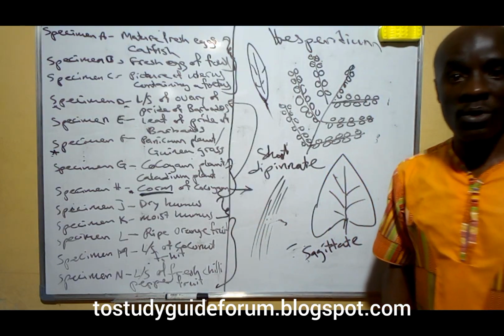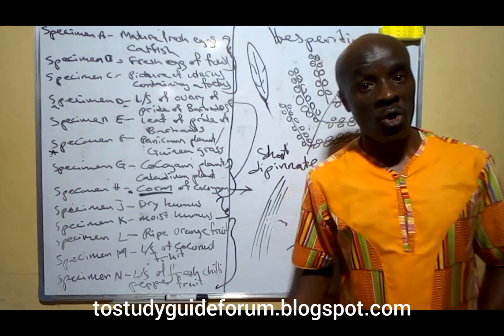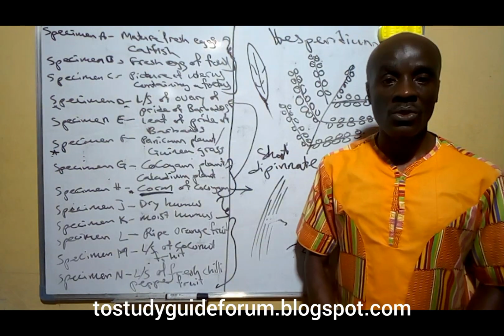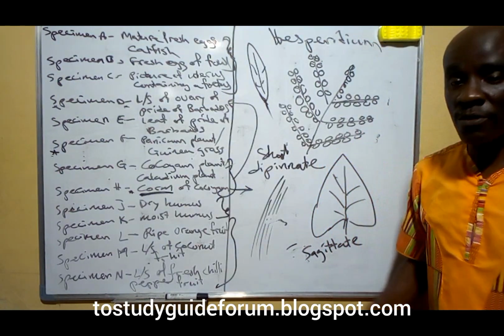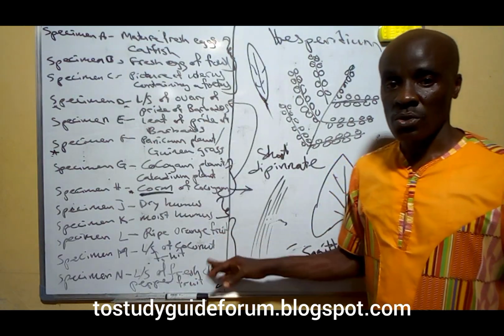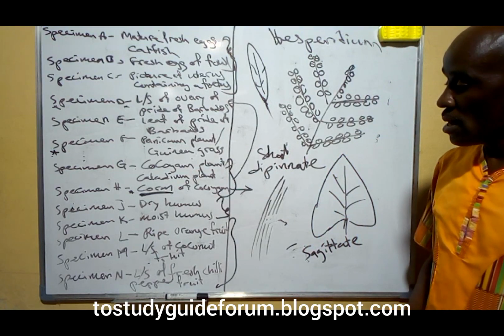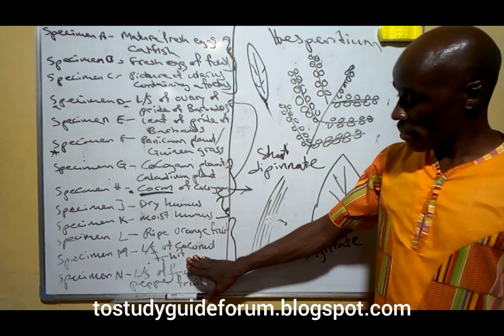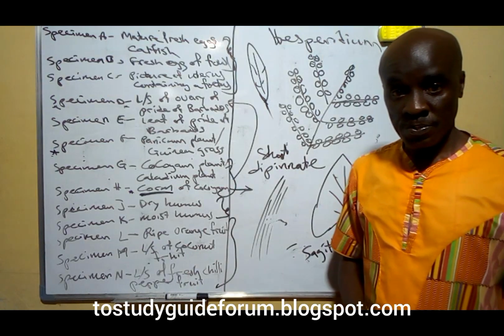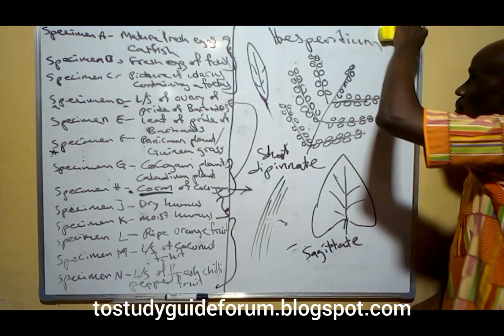We normally call it an isomer of glucose. That means testing with Fehling's solution, which will turn brick red when you add it to such a substance. Now the next thing here, if you come down, coconut is a good example of the one we call the drupe.